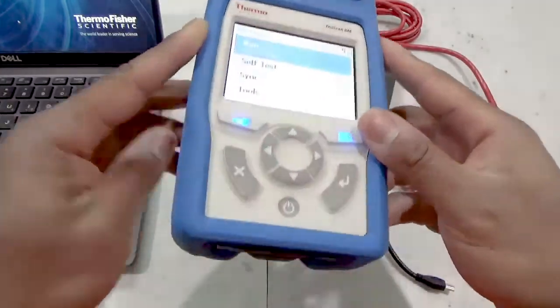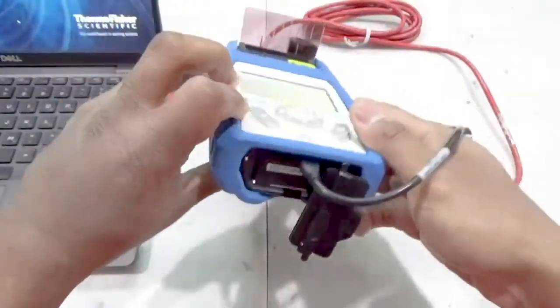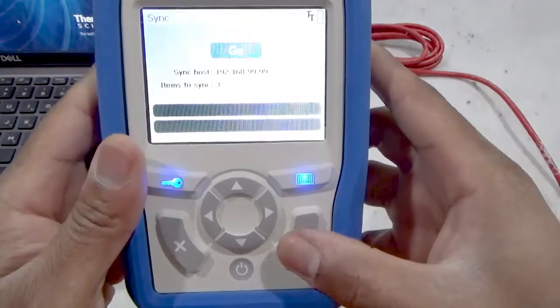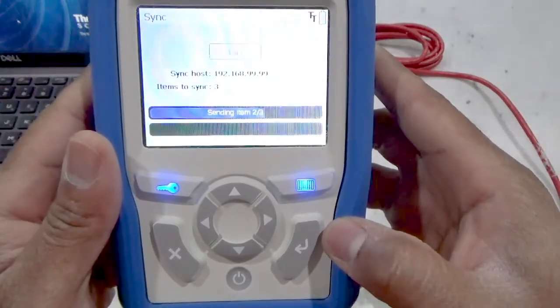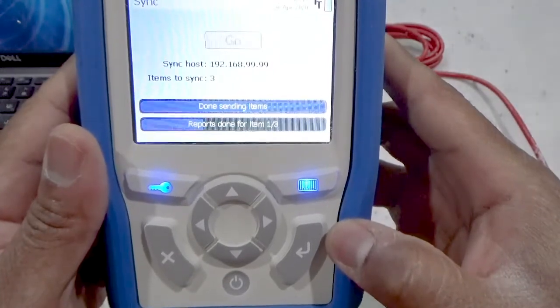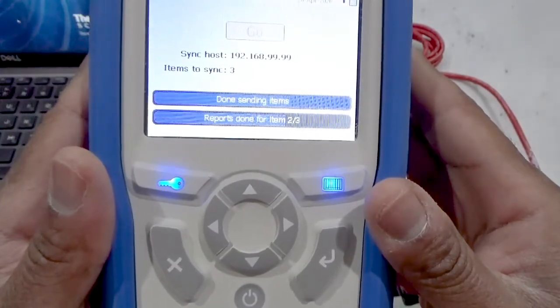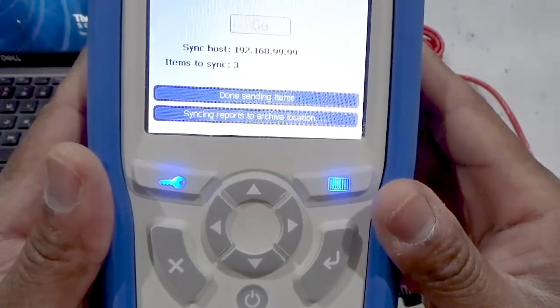Perform a data sync to securely remove the data from your instrument for archival. First, connect your TruScan RM to your network using the USB Ethernet dongle adapter and a suitable Ethernet cable. In this demonstration, I'm using a crossover cable to connect directly to my computer. Once connected, highlight sync from the main menu and press enter. Press enter once again to initiate the transfer of data files to your archive. Once data files migrate over, run reports, batch reports, sync summaries, and audit logs are created and placed into the archive location of your choosing. The instrument status bar will be filled and you'll be informed when the data sync is fully completed.